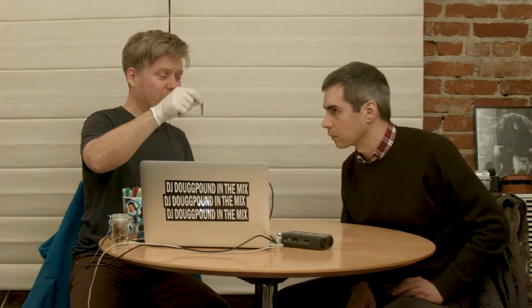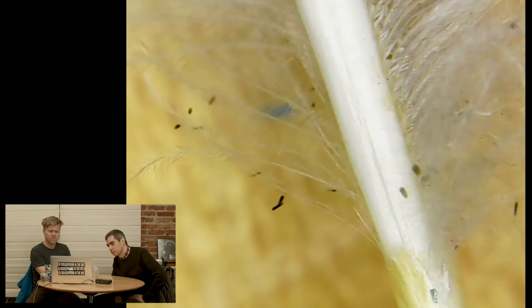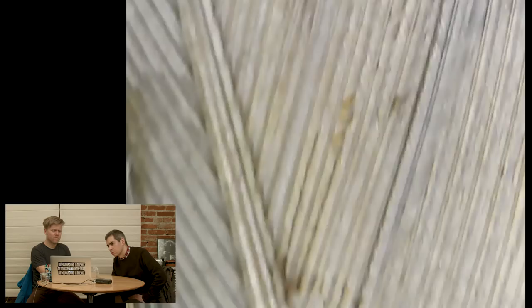Do you want to look at this feather? We have a feather. This might be kind of good. It's got a little yellow on the tip, and it's a little dirty. Let's get to that yellow tip.